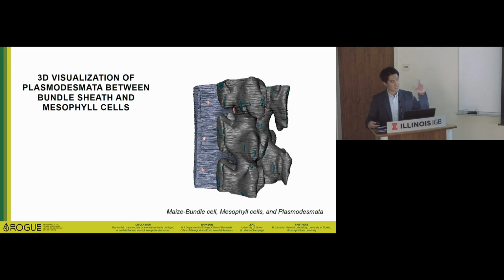So we are collecting this data, and we are also using LSM, just taking live images with a regular microscope. We're comparing all of them. There might be some shrinkage, a volume shrinkage issue, but the value is still comparable with the LSM microscope. That's the reason we still have reasonable shapes and reasonable numbers. But Kingsley does not agree with any shrinkage issue, I think because this is more traditional, I mean, more people use TEM, and all of them use the same sample processing method.